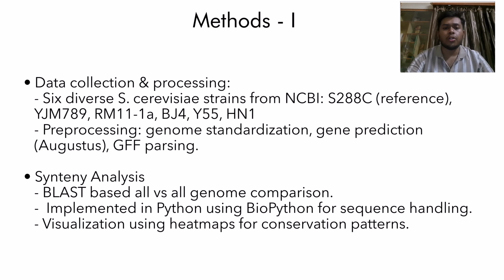We began with genome sequence standardization to ensure uniform formatting across all the strains. This involved converting all sequences to the same format.